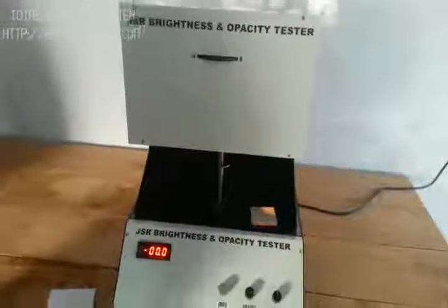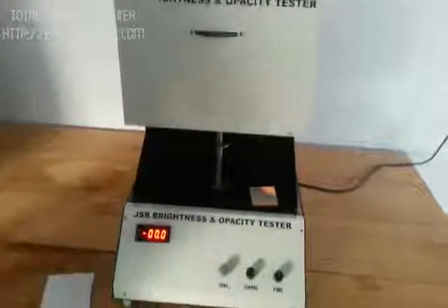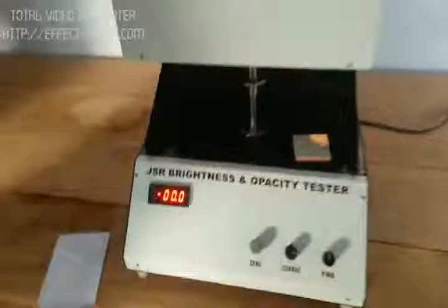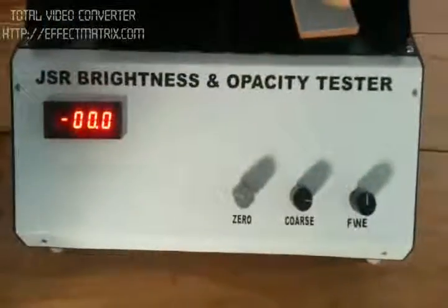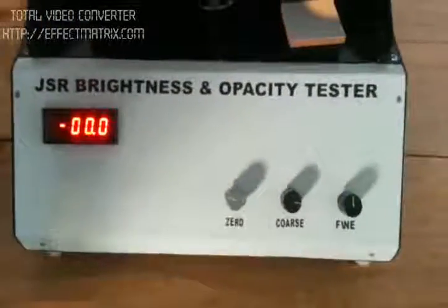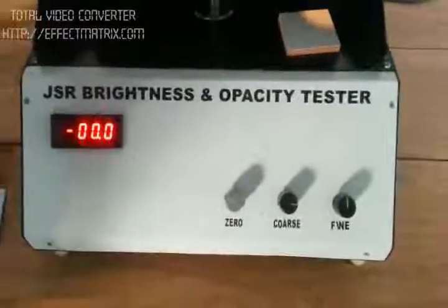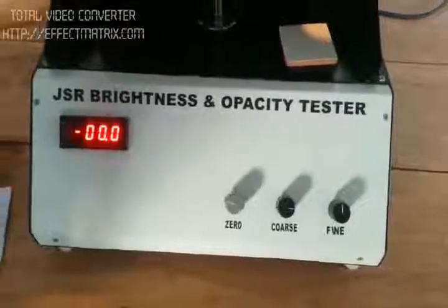This is the JSR Brightness Opacity Tester. This is the front panel of the machine, where there are three ports: zero, coarse, and fine.